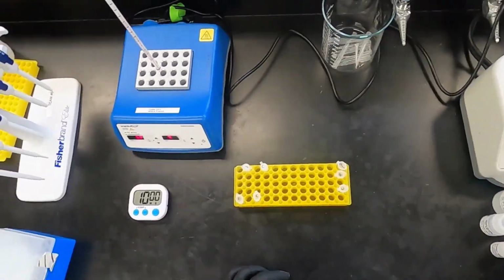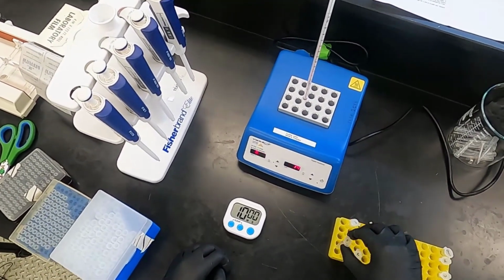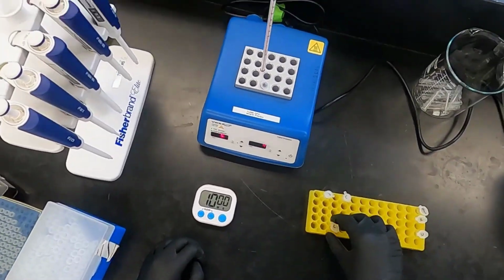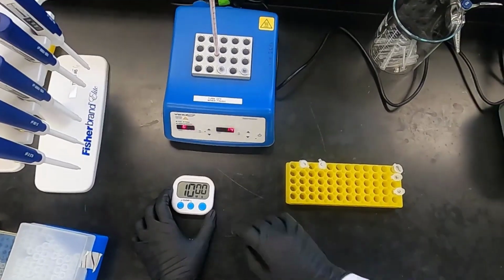Now that we've vortexed every single one of them, we're going to incubate them at 65 degrees Celsius for 10 minutes. So we're going to add them to our hot plate here. And we're going to start a timer for 10 minutes.